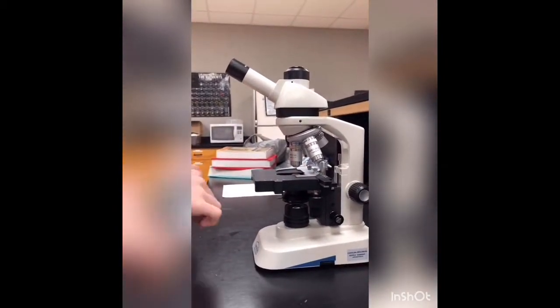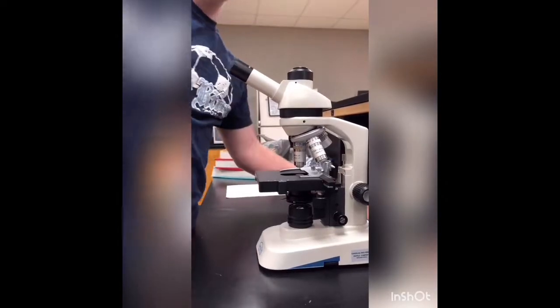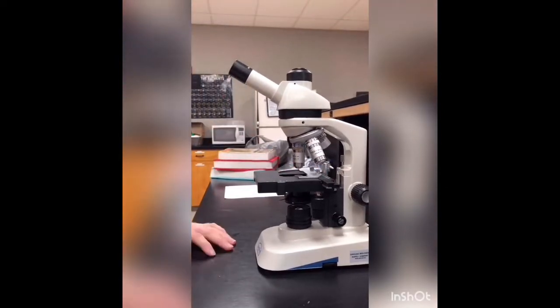Caden will show you steps 22 through 25 of operating your microscope.